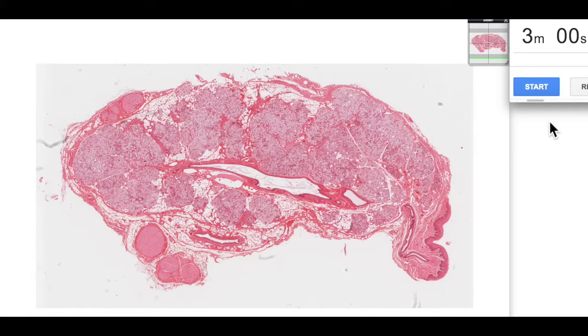Here we're going to have a look at the sublingual though. So let's start our three minutes. Like the other paired salivary glands, the sublingual salivary gland is encased within a dense irregular connective tissue capsule, and that capsule throws in some septa, connective tissue septa, which divides the gland into lobules.